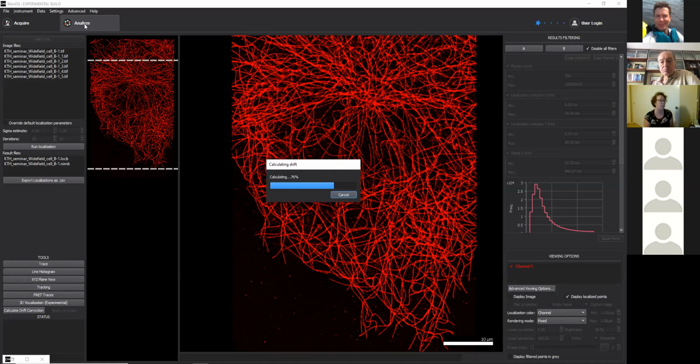being acquired. The other important thing to consider to reduce drift is just to leave the sample on the microscope for a while to let it equilibrate to the temperature of the microscope and to make sure that everything's sort of stationary as you begin that acquisition.